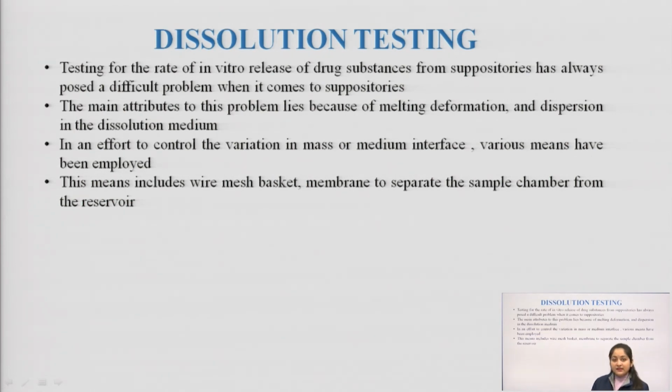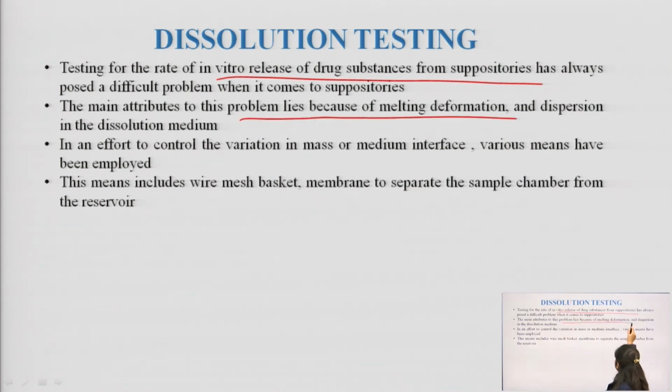This is another test known as dissolution testing. Now dissolution testing is quite a famous test, because be it your capsules, be it your tablets, the testing is going to remain the same. The water bath and the apparatus definitely remain the same when I study dissolution testing. So testing for the rate of in vitro drug release is actually a difficult problem when it comes to suppositories, because of the melting and deformation.